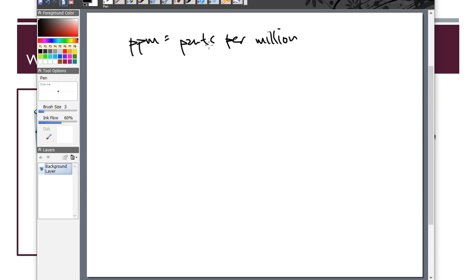So ppm is also parts per million, but ppm is also known as milligrams per liter of solution. What that means is that if I take a volumetric flask in a laboratory, maybe a 1 liter volumetric flask, that's 1,000 milliliters, folks. If you're thinking about volume, go back and think about the grocery store, the 2-liter bottle, and cut it in half, that is a liter.